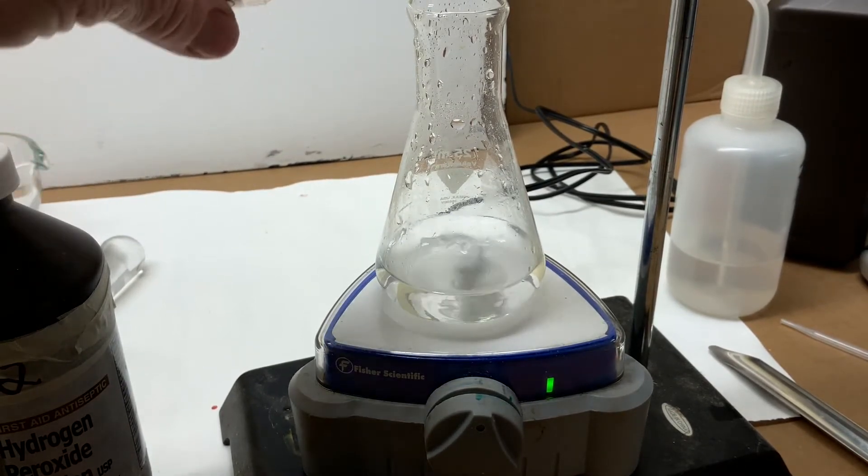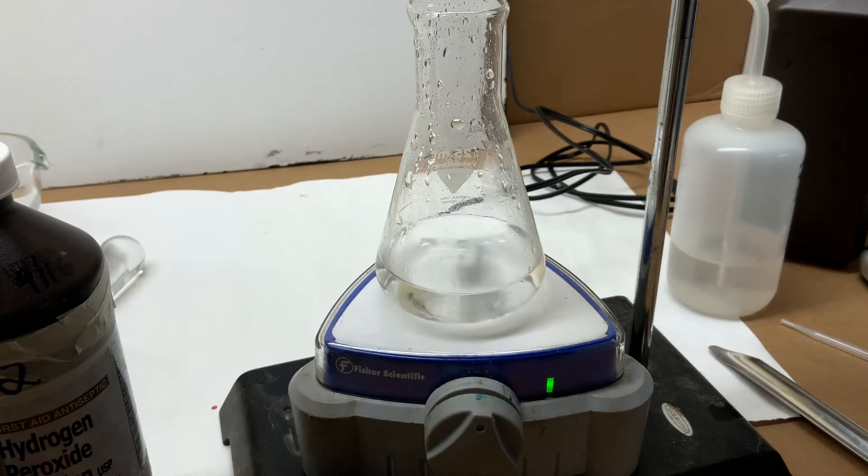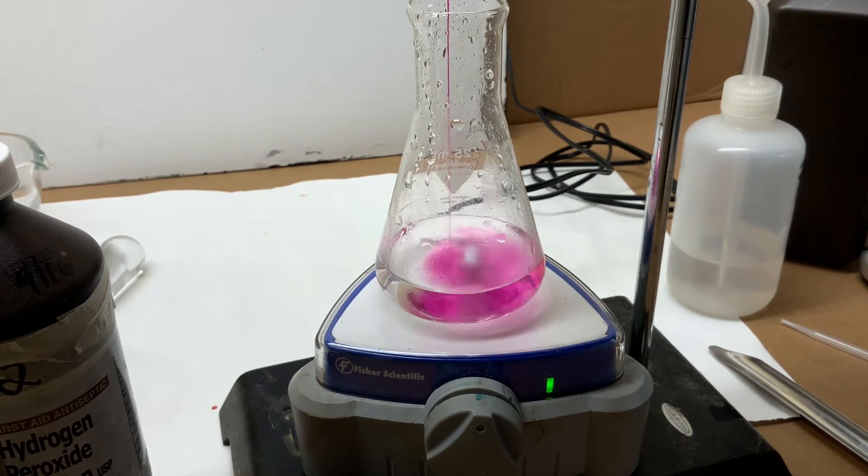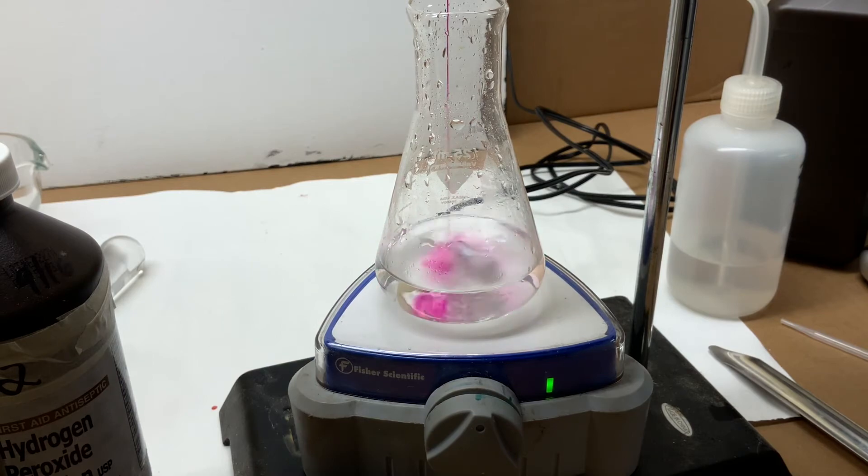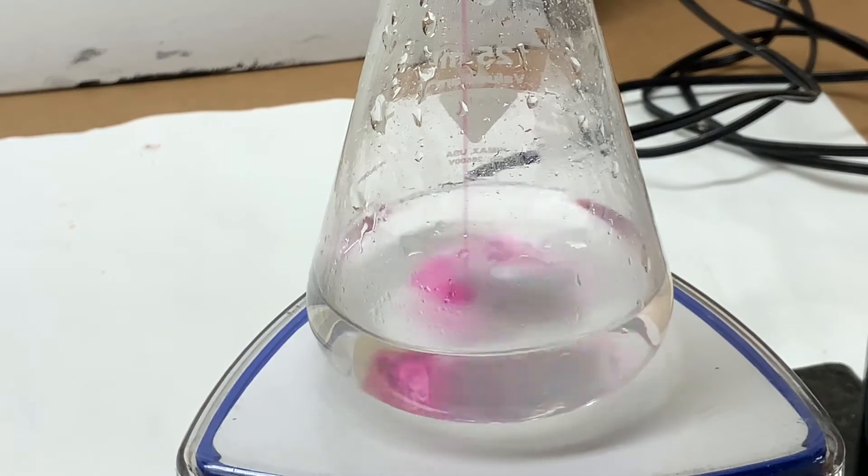You can just see it coming in here. And then we'll start the titration. Reading your procedure, you realize that the pink shows up right away, but don't stop the titration. There is an initial amount of permanganate that must be added for the reaction to actually get started.